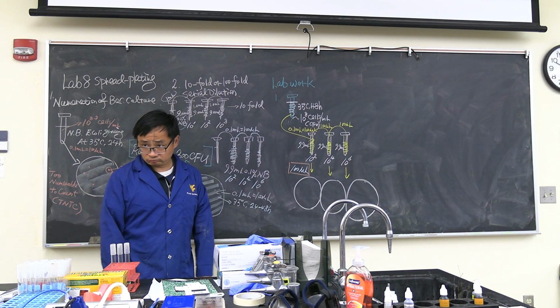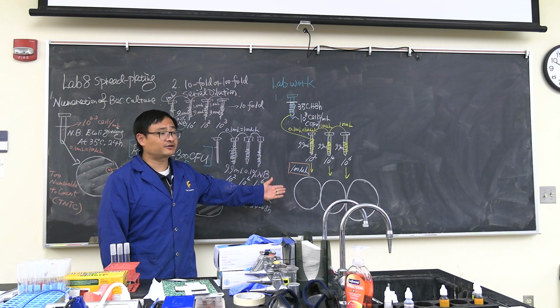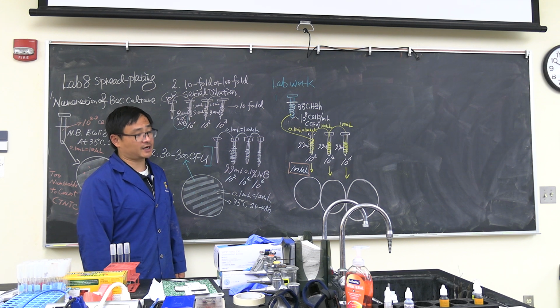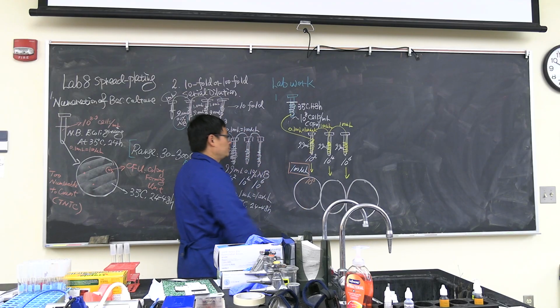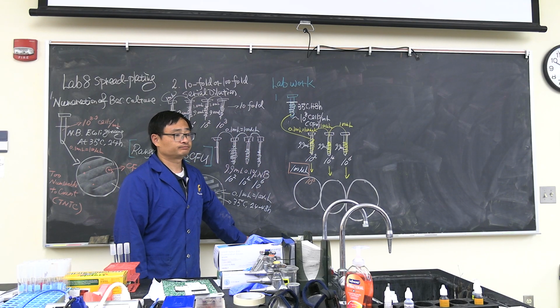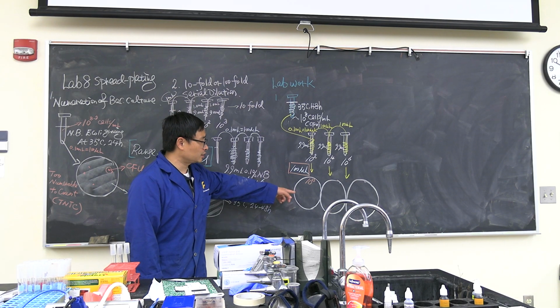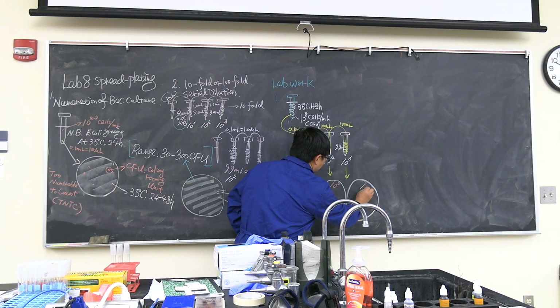What this tells you is that once they are added onto the agar plates, they are further diluted tenfold. So what is the final dilution factor of the agar plates? It will be 10 times more than the tube. So corresponding to the dilution factor of 10 to the power of 2 of the first tube, the final dilution factor of the plates is 10 to the power of 3. So this will be 10 to the power of 5, and this will be 10 to the power of 7.